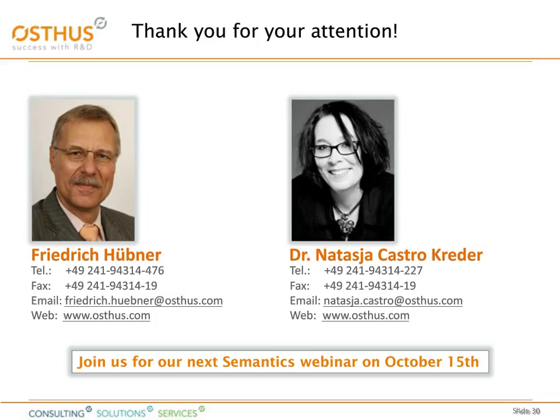Thank you very much. And what in your opinion are the future trends? Well, there is a certain need in the future to combine structured and unstructured information. This area has not been solved completely to the satisfaction of everybody. And with the invention of ELNs, there is a lot more information now captured, and it's about now unlocking this data and unstructured data that is kept there to make it available for advanced analytics.